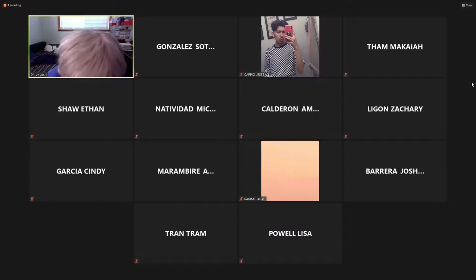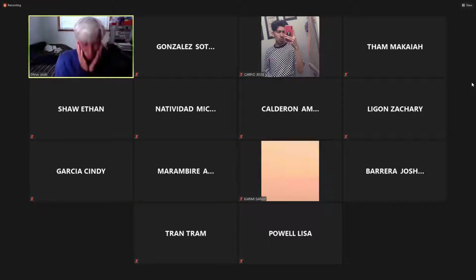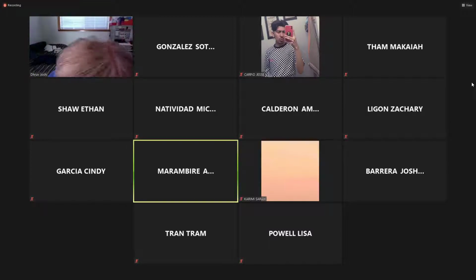Yeah. So since we have like 1.5 grams of the baking soda, we're gonna say 1.500 grams divided by the total mass of the baking soda times 100. And what is the total mass of the baking soda? Let me see.